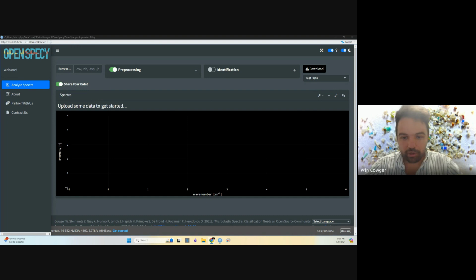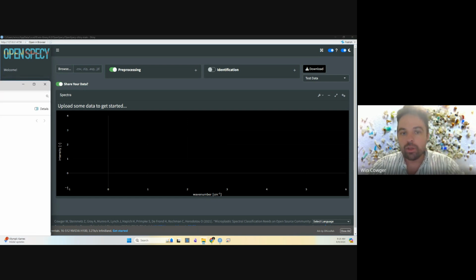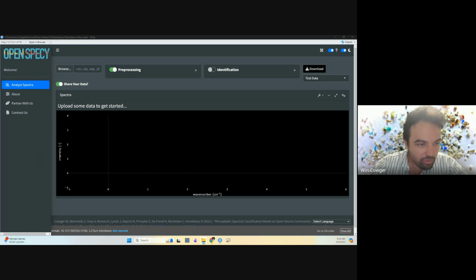Okay. Last time that we got together, we talked about single spectra analysis, where we have one spectrum, we want to identify what it is, and we want to process it, and we walked through exactly how to do that. In this one, we're going to talk about what if we have hundreds or thousands of spectra that we want to analyze simultaneously? Open Specy can do that too. I'm going to use a basic example, but you can grab an example of multiple spectra that works for you. You want to find quite a few spectra.